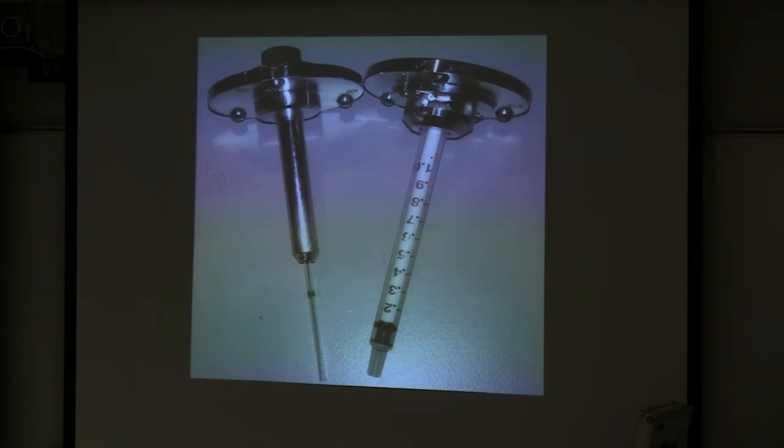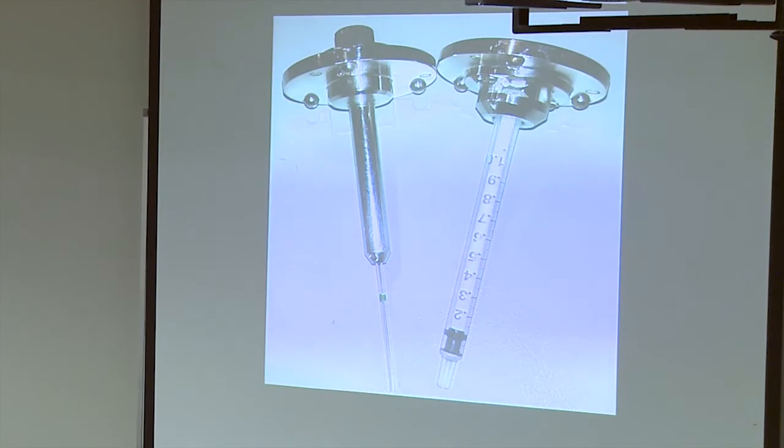Okay, so our two main tools for mounting samples are these glass capillaries. This is traditionally what's used, or a 1 ml syringe. These glass capillaries come in four different sizes. They range everywhere from 700 microns up to about 2 millimeters. So those are for our smaller samples.